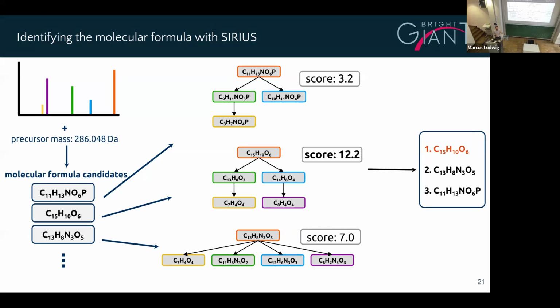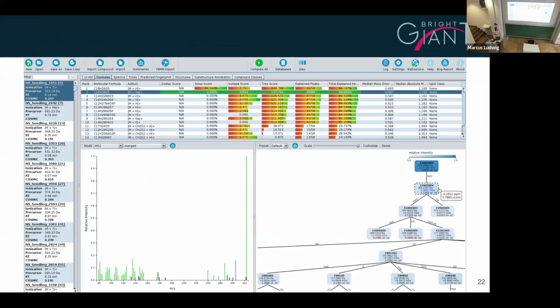So if you measure a compound today and tomorrow, you will always have measurement errors. You don't have the exact mass of the molecular formula. By providing the spectrum in a much more structured way with the fragmentation tree, we make it much easier for machine learning to do a good job and make good predictions for your structure. When we then use the software, this is the panel you're looking at if you want to annotate molecular formulas, but I will guide you through this in the hands-on.